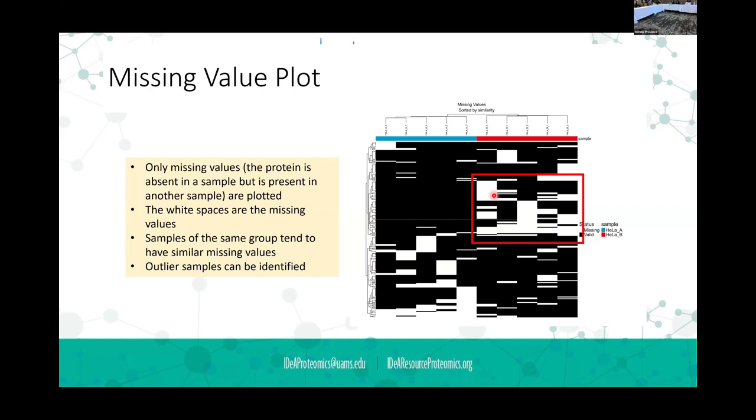And remember, the mass spectrometer is cycling through, and it's measuring, and then it's measuring, and it's measuring, but there's a cycle time as it's measuring. And so it may be that at a low concentration, that peak passes, and those ions don't get captured, they don't get filled, and they don't get analyzed because it's so low level.